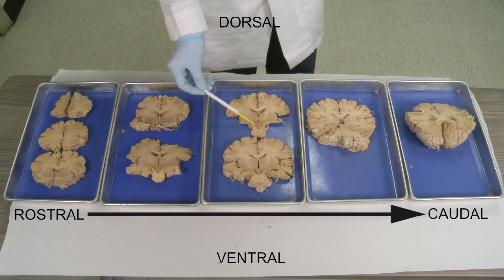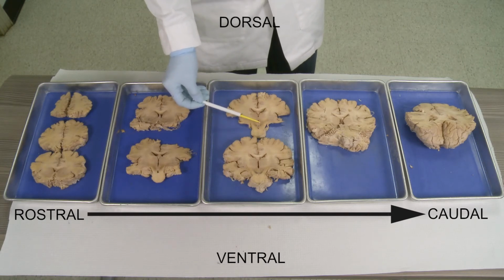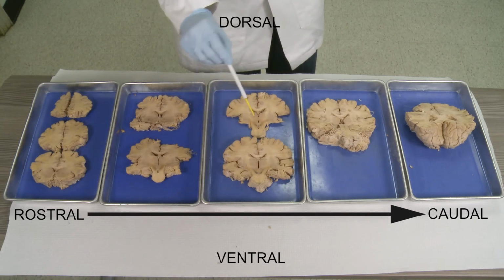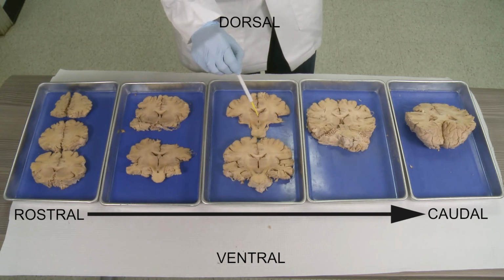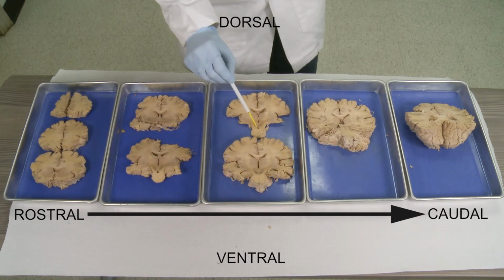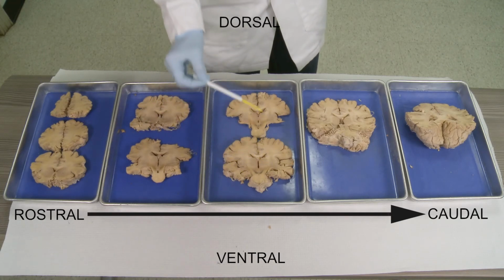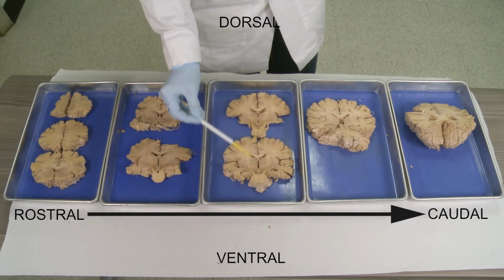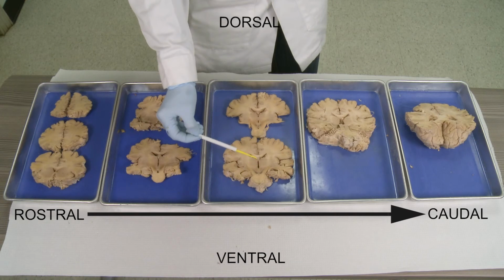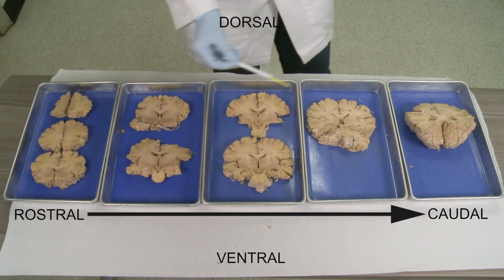Next level, you will also have the very well distinguished midbrain. So this is the pons, this is the midbrain, diencephalon, and this is the cerebral hemisphere. Lateral ventricle, third ventricle, you can see here, and then the midbrain. This level really shows very well the hippocampus, and shows very well the midbrain and substantia nigra. Then this is the pons. Again, this is the diencephalon, with the basal ganglia here on the lateral side.